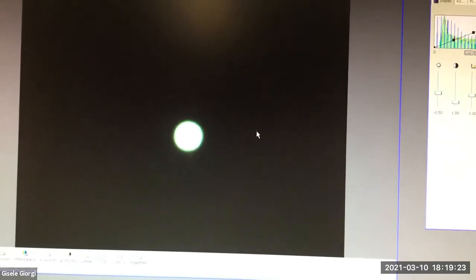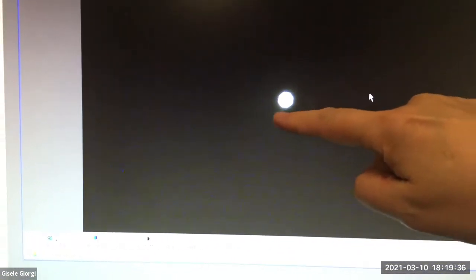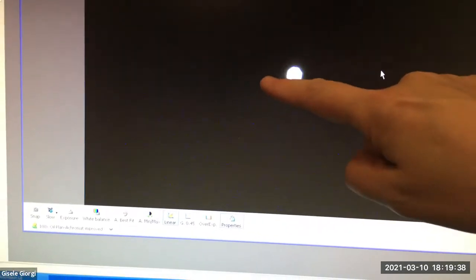Okay, so do you see how it's crisper now? I hope it's showing up. The edges are a lot crisper now. Like you can actually see that it's a polygon. There's an edge, an edge, an edge. Good, thank you. I appreciate the thumbs up a lot. So that's better.